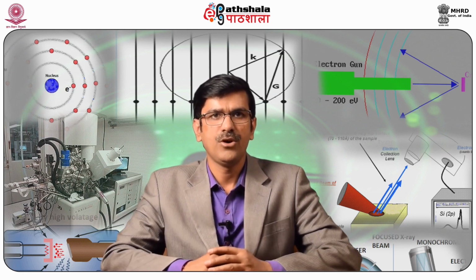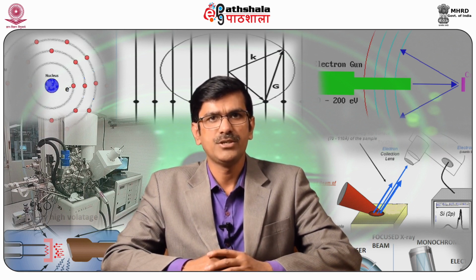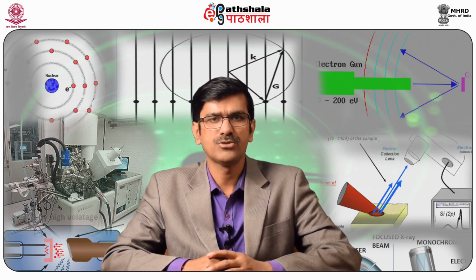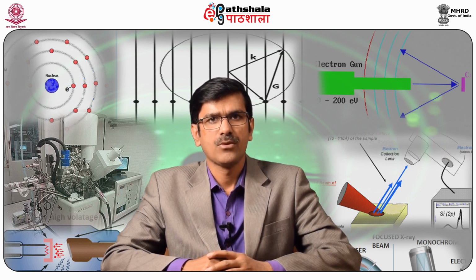The purpose of an X-ray monochromator is to produce a narrow X-ray line by using diffraction in a crystal lattice. Powerful synchrotron electron accelerators have become an efficient photon source for all kinds of X-ray applications, notably photoelectron studies.